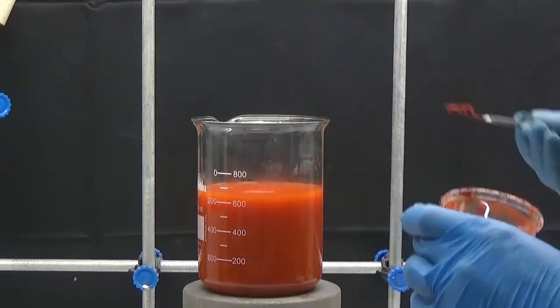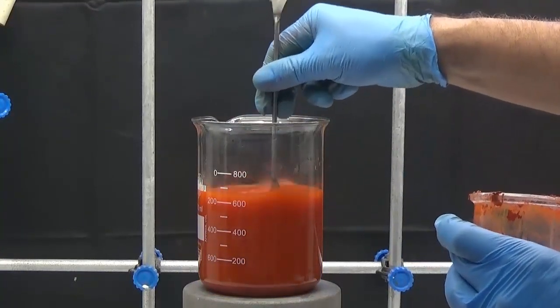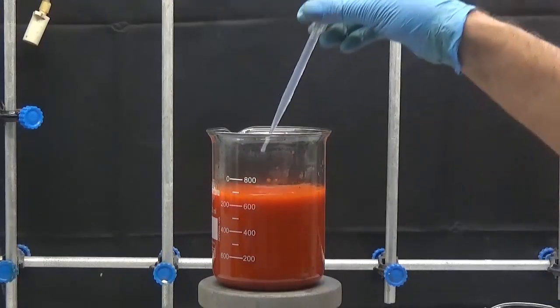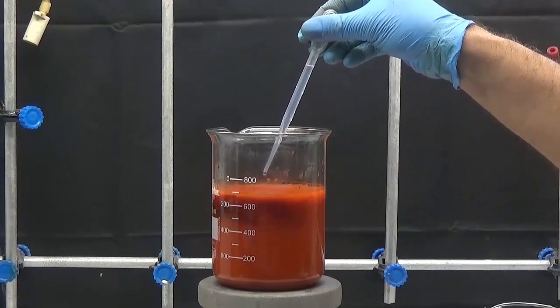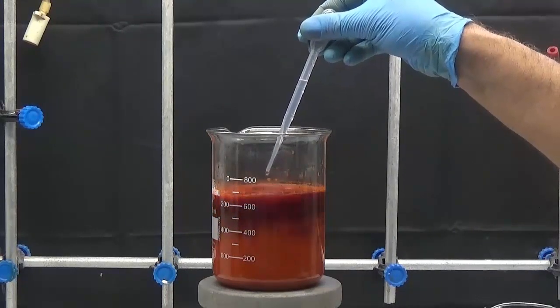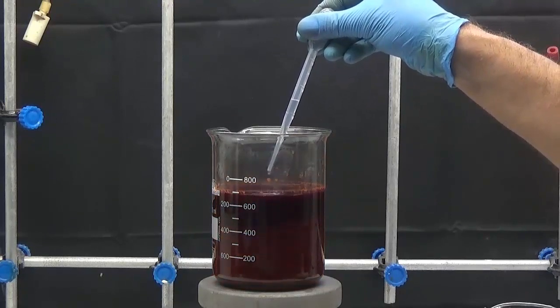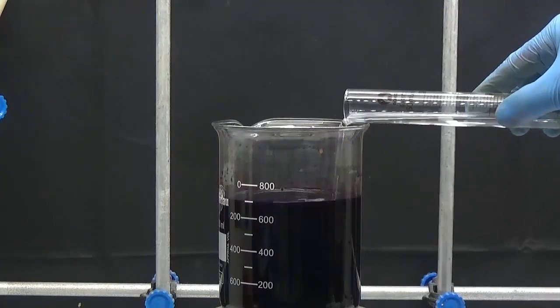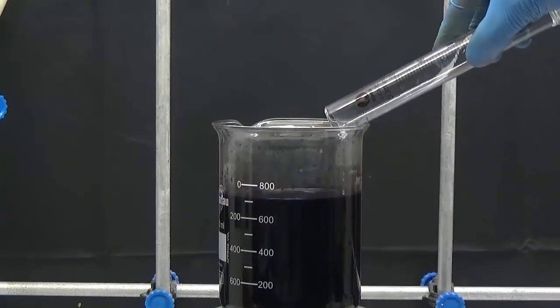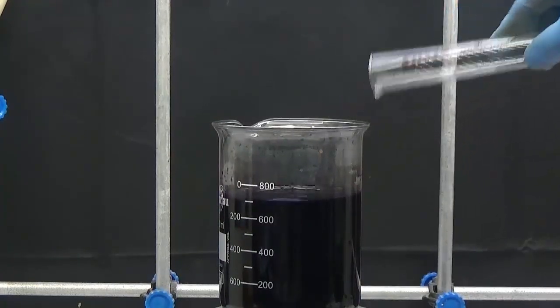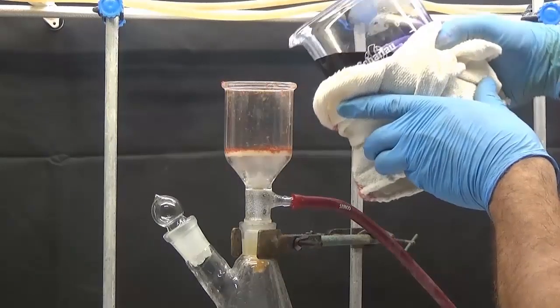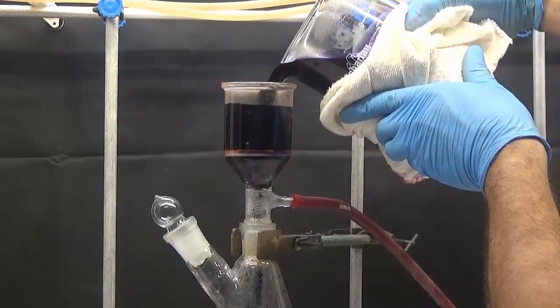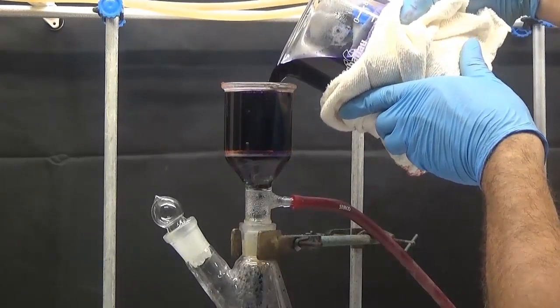Add 3 milliliters of 50% potassium hydroxide solution first. The solution has to be violet. Then add 30 milliliters of 50% potassium hydroxide solution.